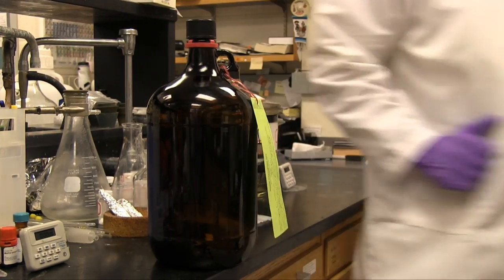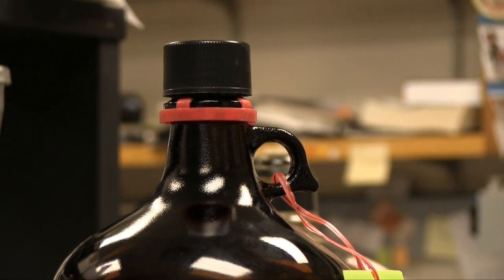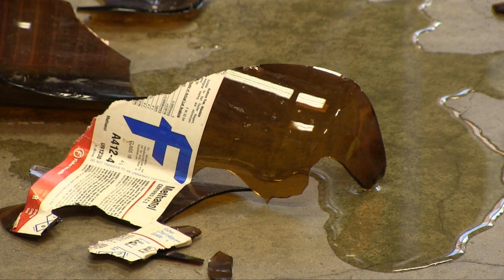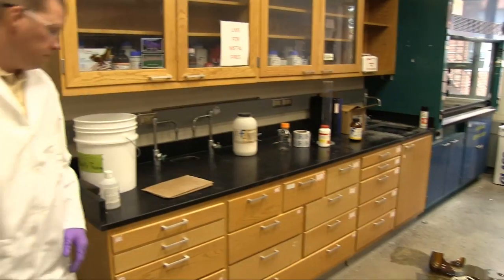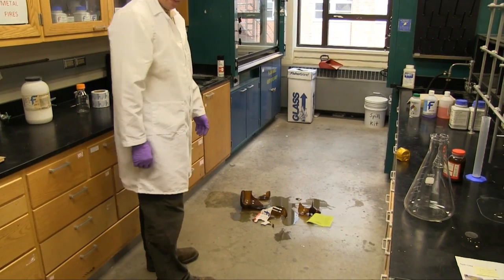You place a bottle of chemical waste on the counter and step into the next room. Then you hear a loud crash. You return to find your bottle broken on the floor. Since you have user knowledge of the spilled material, you know that there are no significant hazards present and you have the appropriate training to clean up the spilled material. If you didn't have user knowledge of the spilled materials, you would want to consult a safety data sheet for proper spill cleanup procedures.